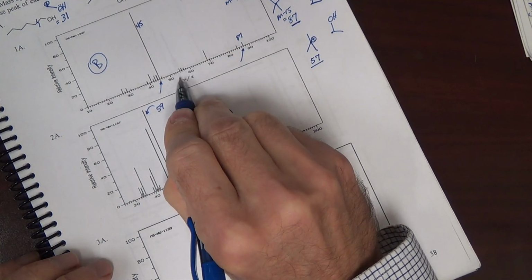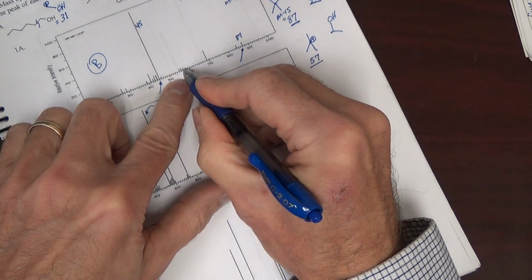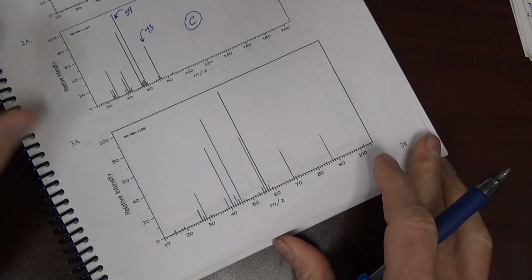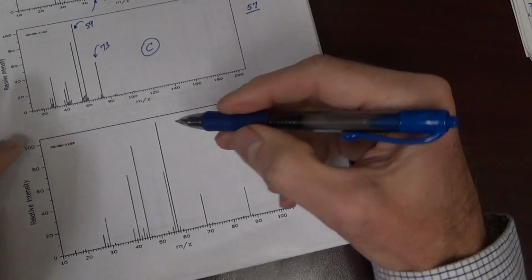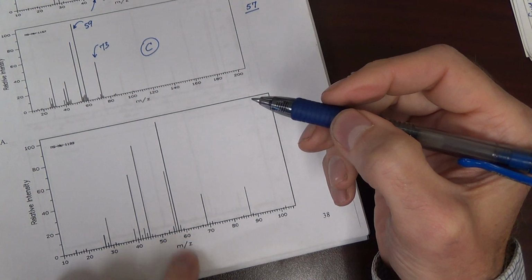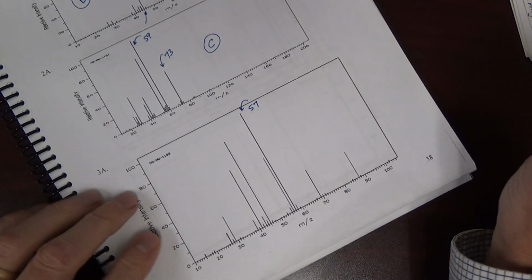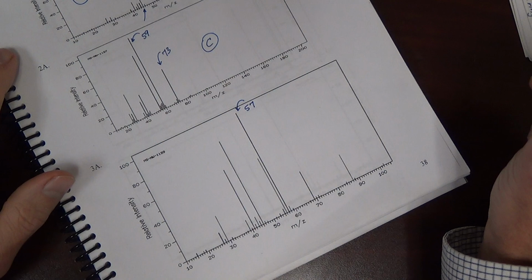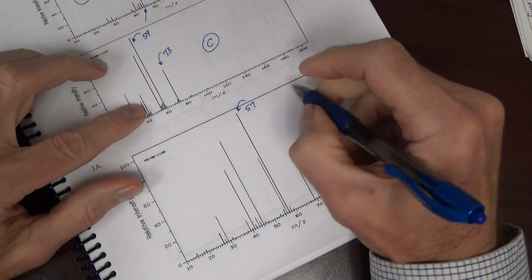Now this mass spec shows a 57, but it's very weak. Let's look below. The base peak is 57. Base peak. That gives us our answer right there. We predicted a 57 for D.